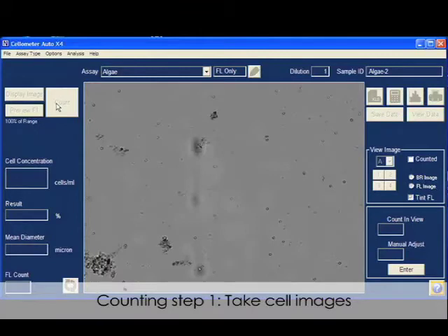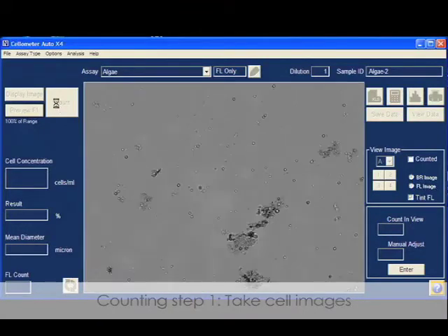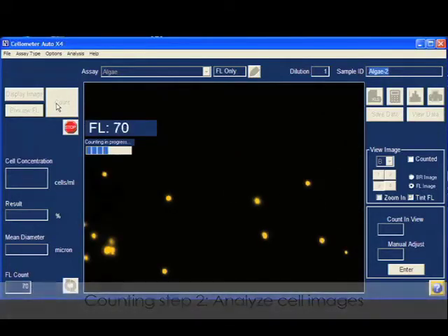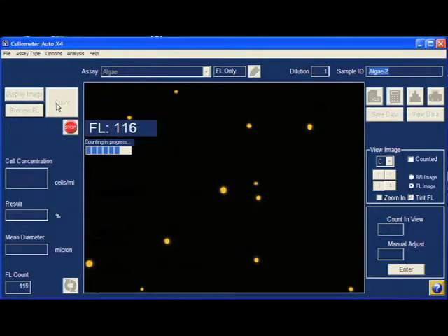Cellometer AutoX4 takes cell images in bright field and in fluorescence. Cell images are automatically analyzed based on preset parameters for algae cells. Other debris is excluded by its lack of fluorescence.